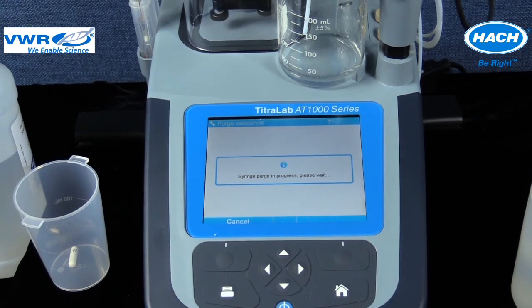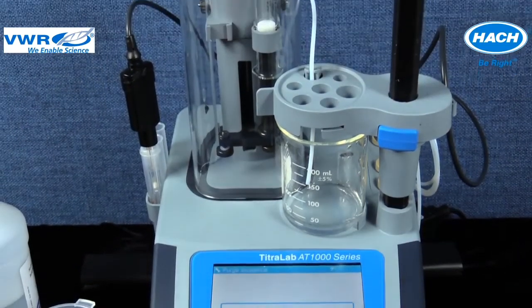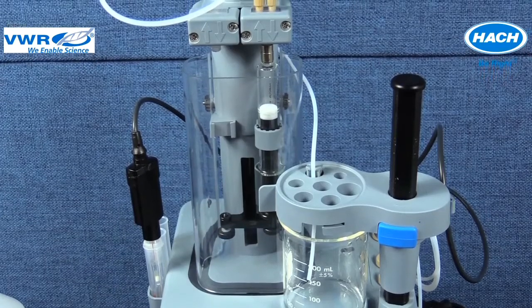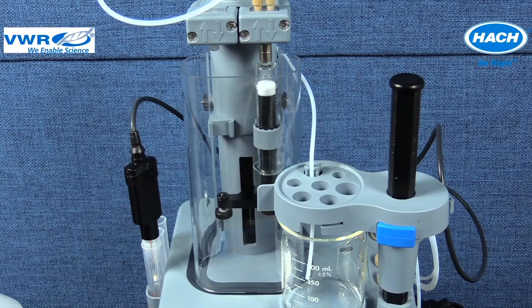The software will activate an internal valve to open the syringe that is selected and close the valve for the syringe that is not selected. When the syringe purge function is selected for that position, the titrator pulls titrant from the titrant bottle, fills the syringe several times, and dispenses the titrant to the sample beaker. Any air bubbles in the syringe should be evacuated during the filling and dispensing action. Fresh titrant is seen leaving the dispensing tip.